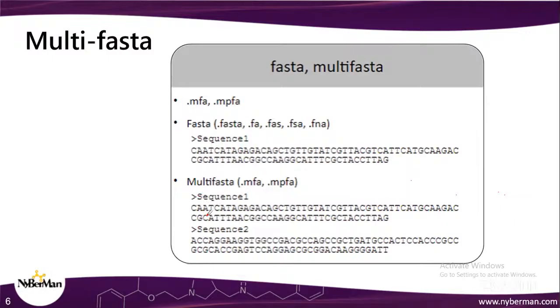Okay, and more than two headers corresponding to each sequence. So a .mfa file, the multi-FASTA file, cannot have only one sequence. That will give an error if you provide this file with just one sequence as an MFA extension. Okay, so hope that is clear that we have the FASTA file in the first category. We need to understand the order and format of this file, and the extended file format is multi-FASTA.